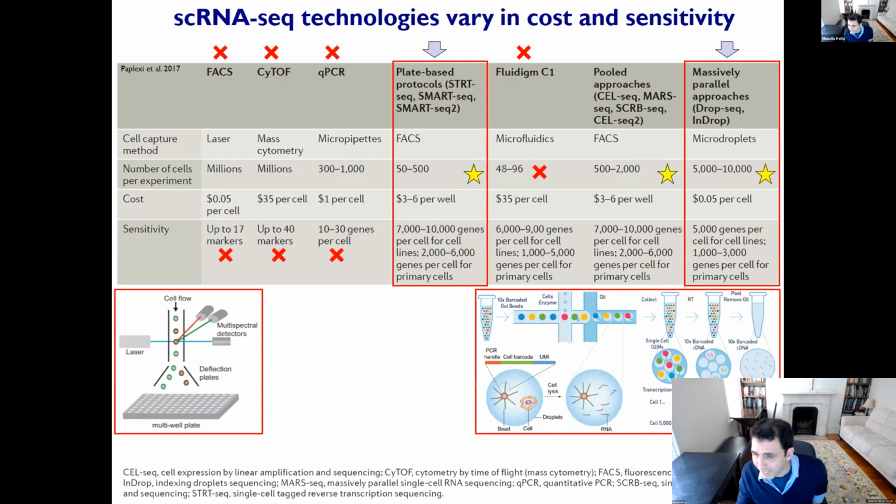So the next step is very cool. You now want to avoid doing a single sequencing reaction for every well. So what you're going to do instead is very smart. You're simply going to now capture all of those individual RNA molecules that have been barcoded with the corresponding cell identity in a single big tube, everyone labeled by the cell that they came from.